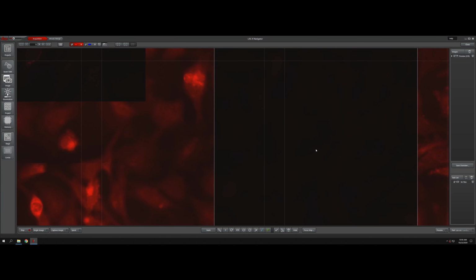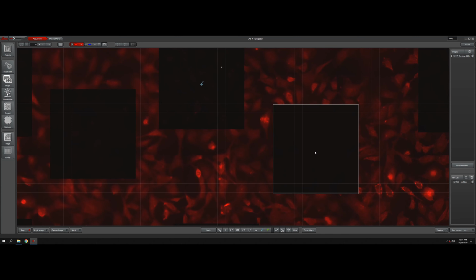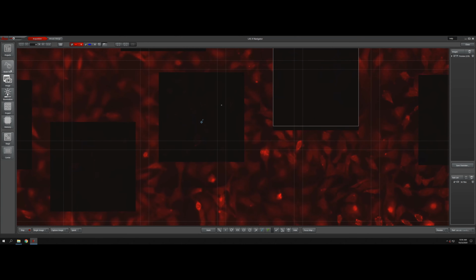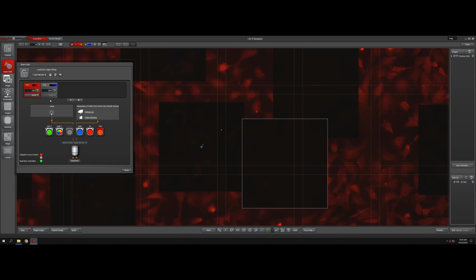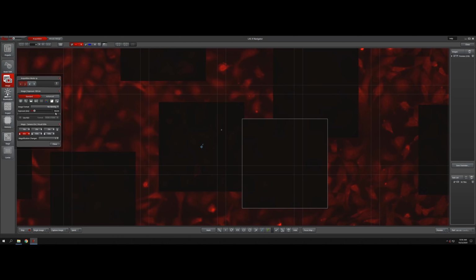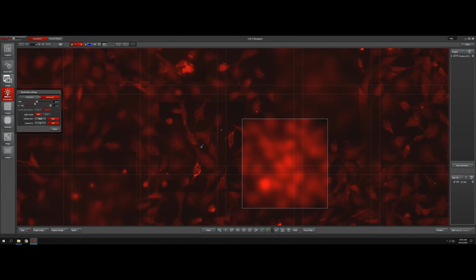So I'm trying to check. Did we bleach this so much? Interesting. I don't see anything now. Okay, let's go check the beam path. Image, alright, 100 illumination, let's go up just a little bit. Oh, we're there, maybe we glitched a little bit.